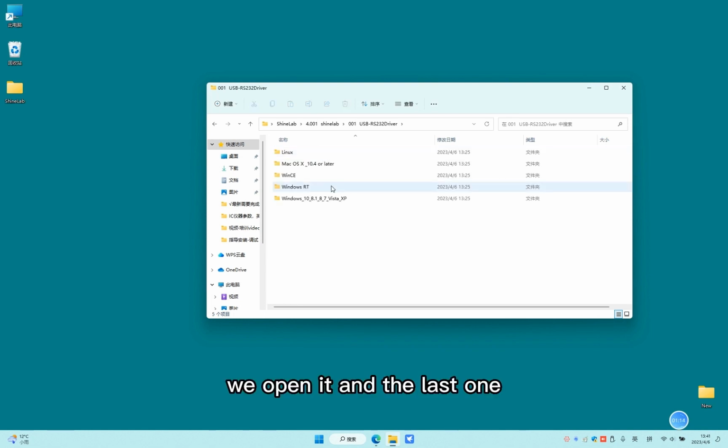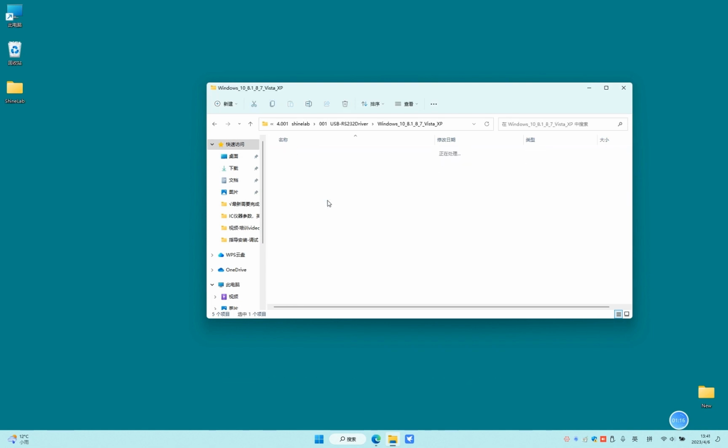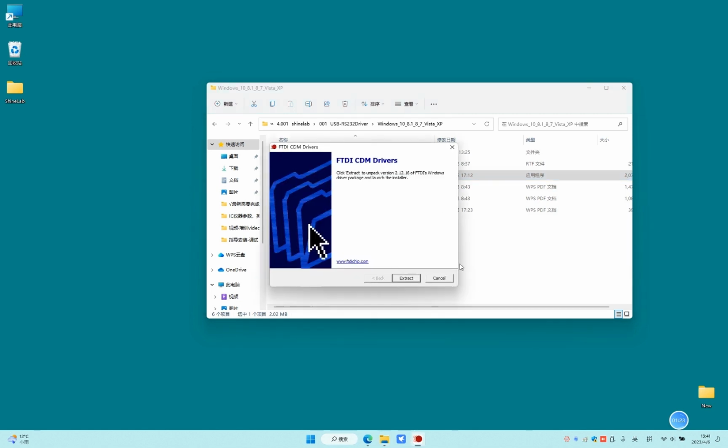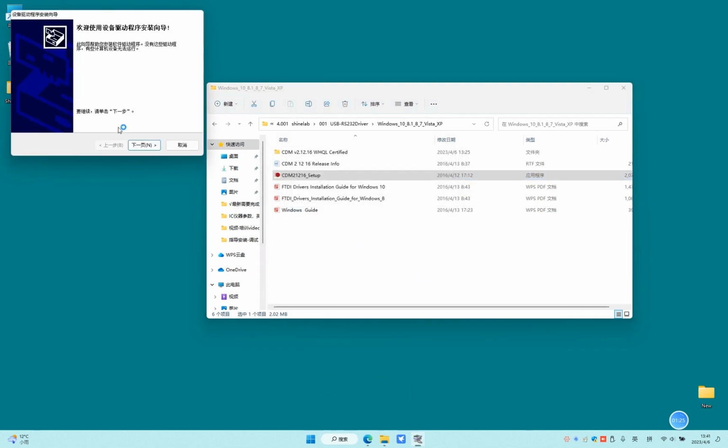We open it, and the last one, the third one, double click, open it, install it.